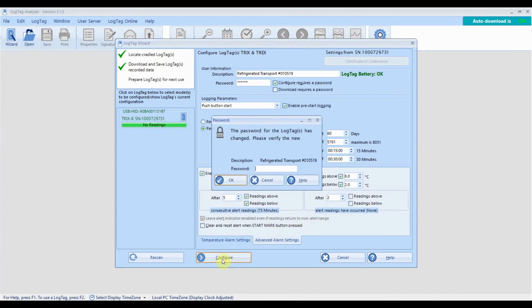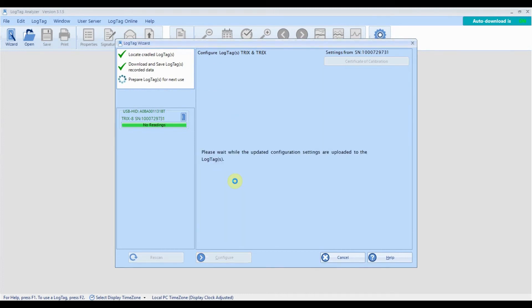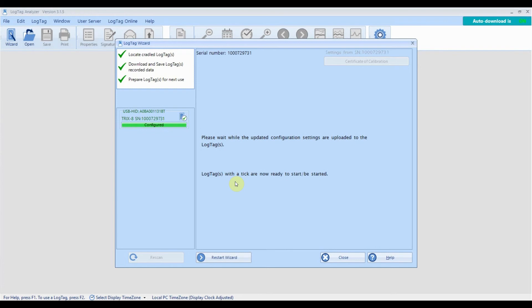Once you are ready, click configure and the wizard will configure your logger with your settings. Once the wizard has finished, you can click close if you are done, or you can insert another logger of the same model and click repeat configuration to apply the same settings to the next logger.